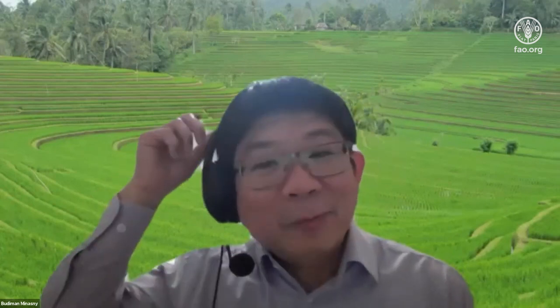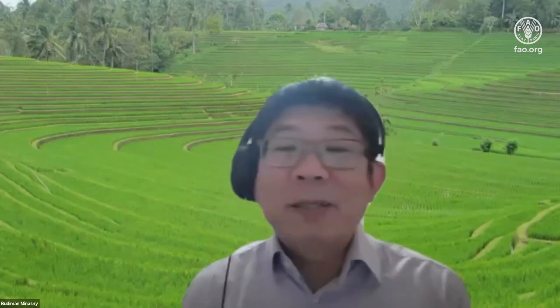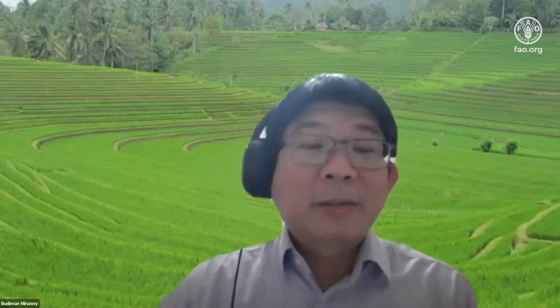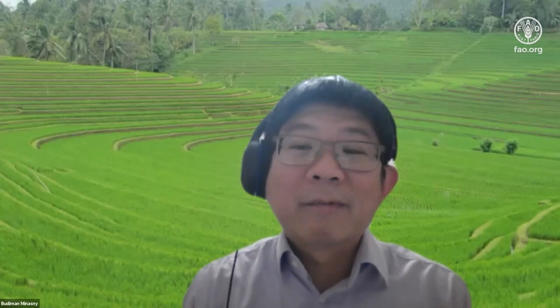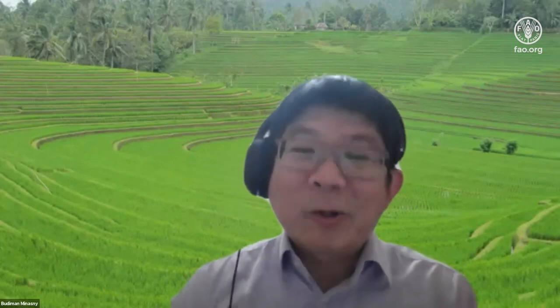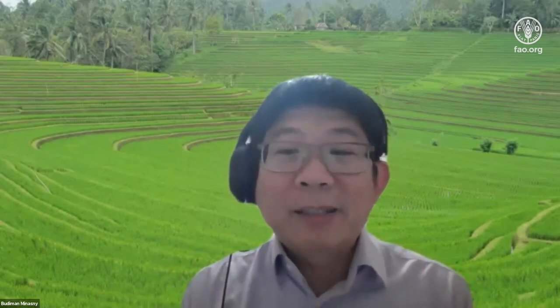So I think maybe it looks like too high a resolution, but it's not every millimeter. On the profile, I think it's every 5 centimeters that we do it. But now using the penetrometer, which my colleagues have done, you can do a continuous measurement, taking a measurement every 1 centimeter. Manually, it's very tiring to scan every centimeter, but with the automatic collection by the penetrometer, we can get spectra for every centimeter.